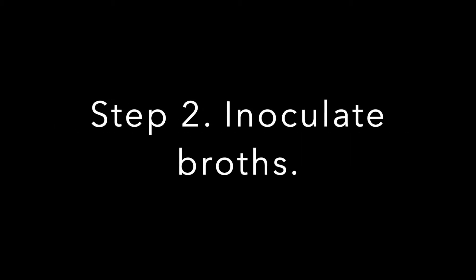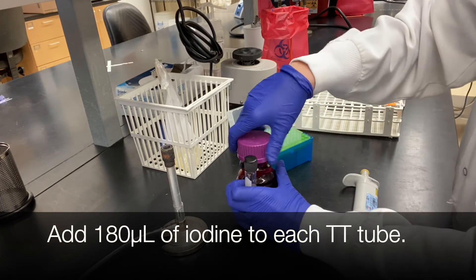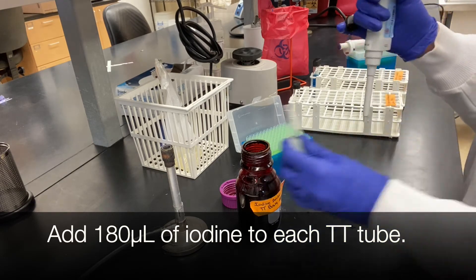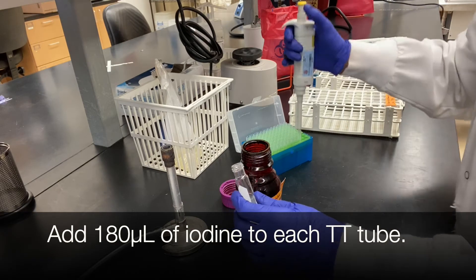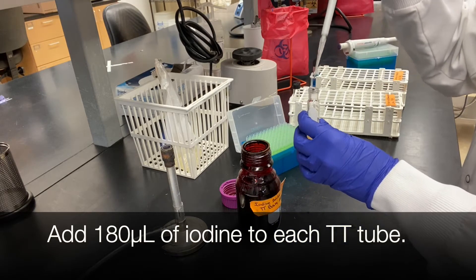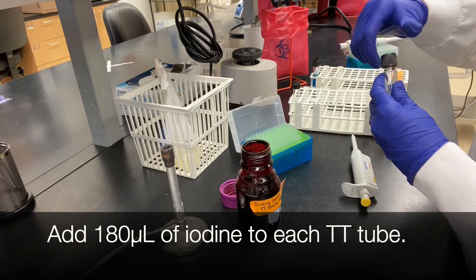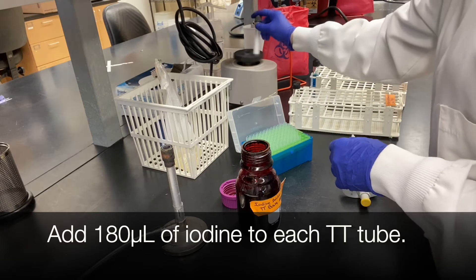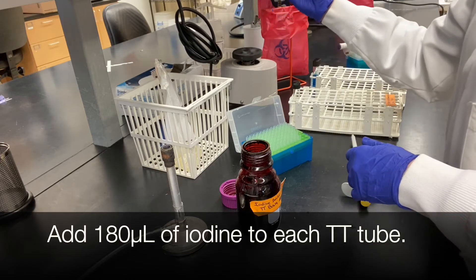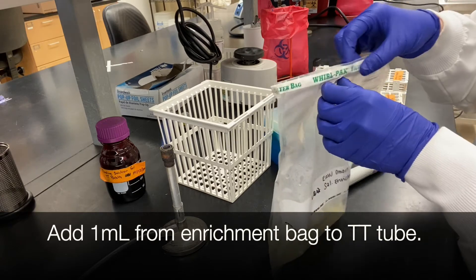Step two is to inoculate your broths. Add 180 microliters of iodine to each tetrathionate tube. Then add 1 ml from each enrichment bag to your tetrathionate tube.